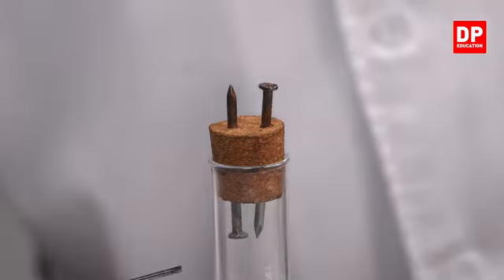If you check the part which is below, which is inside the boiling tube, in this part there is no rust at all, right? You can see it very clearly. These topper parts contain rust, but the below parts, which are inside the boiling tube, do not contain any rust, but these areas contain rust.